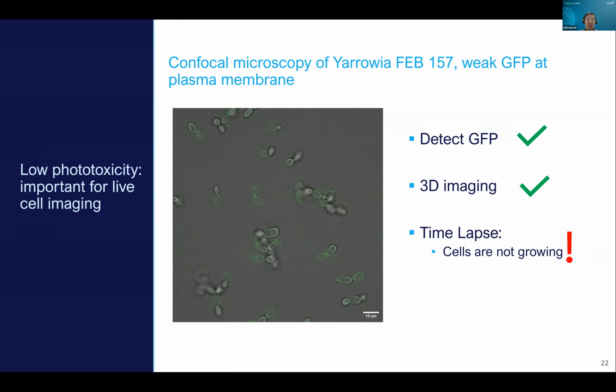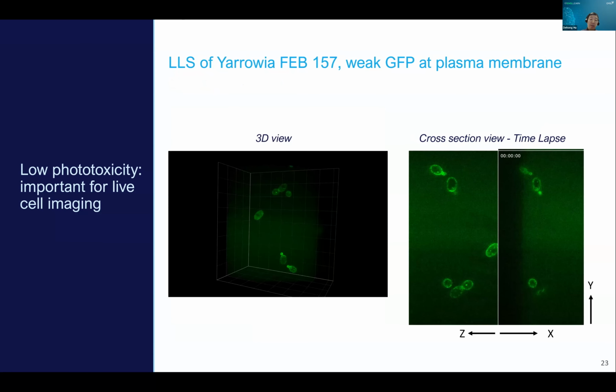Because of the phototoxicity, the cells got some problem. Then for the same system, we tried the lattice light sheet microscope. This one is much better.